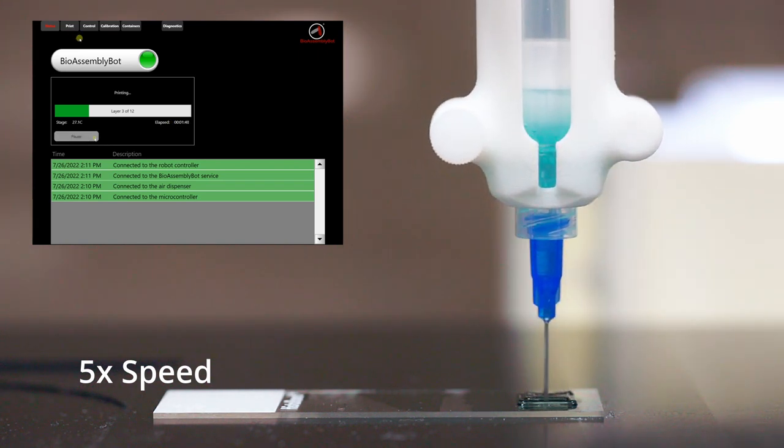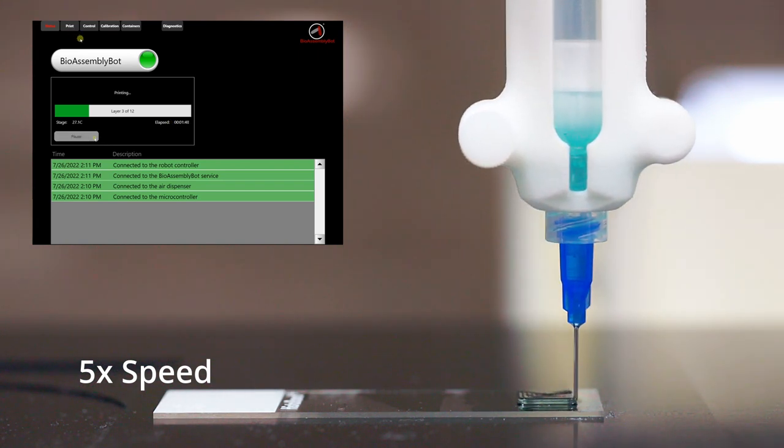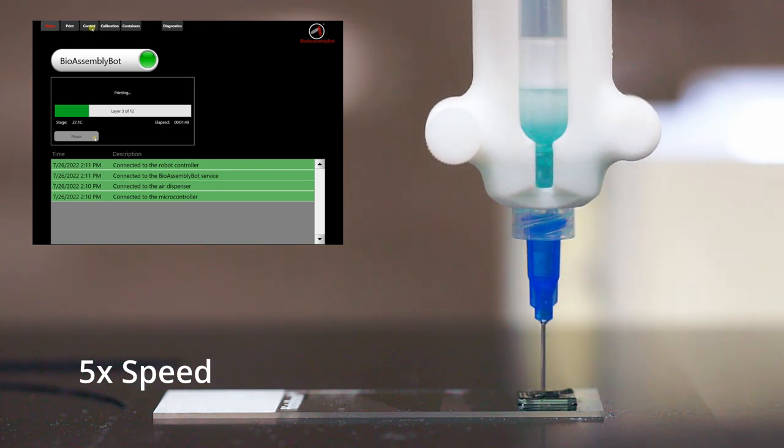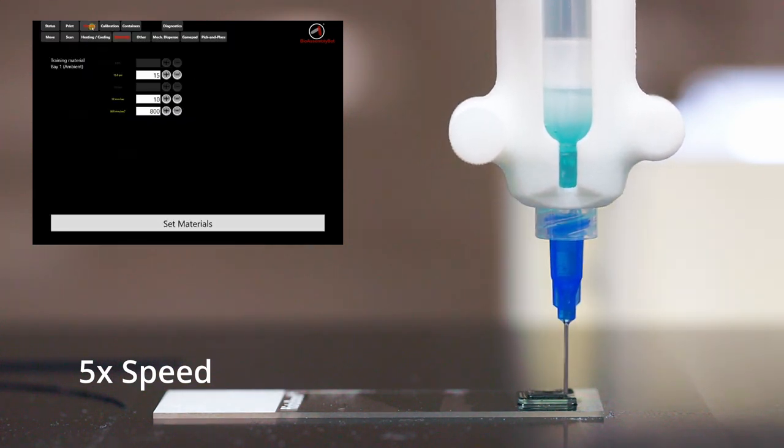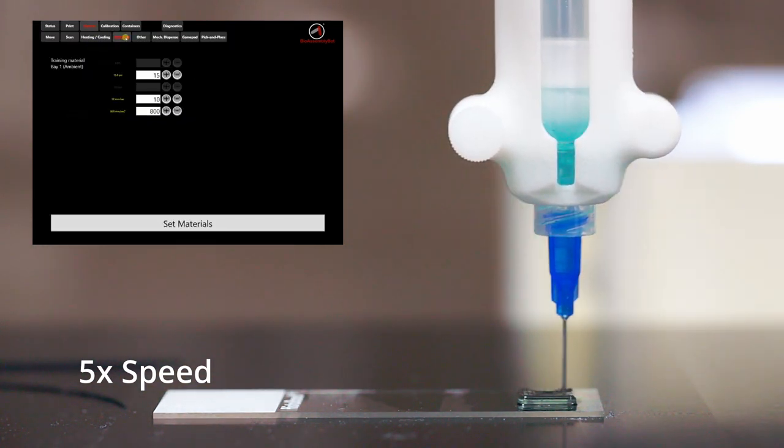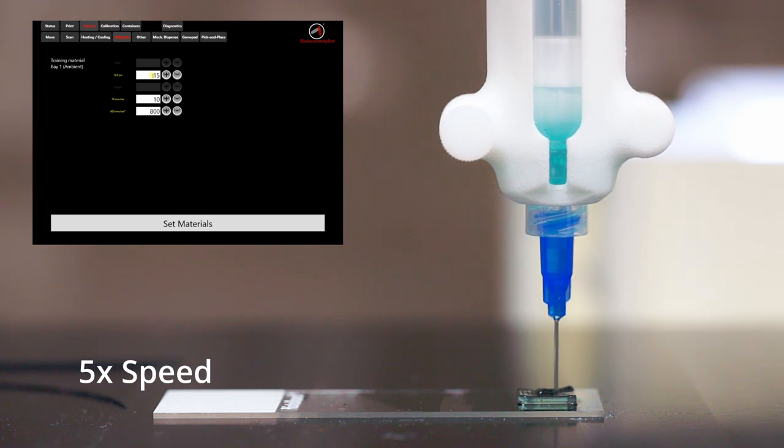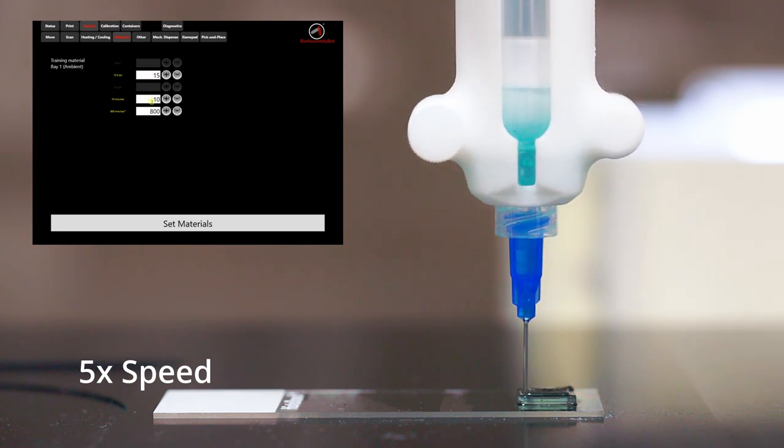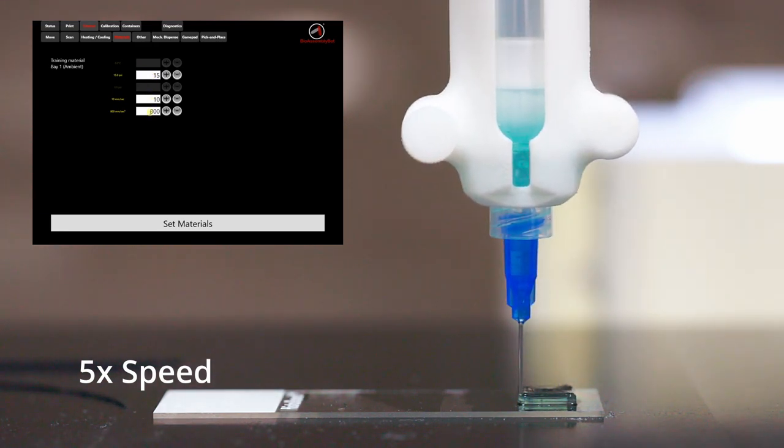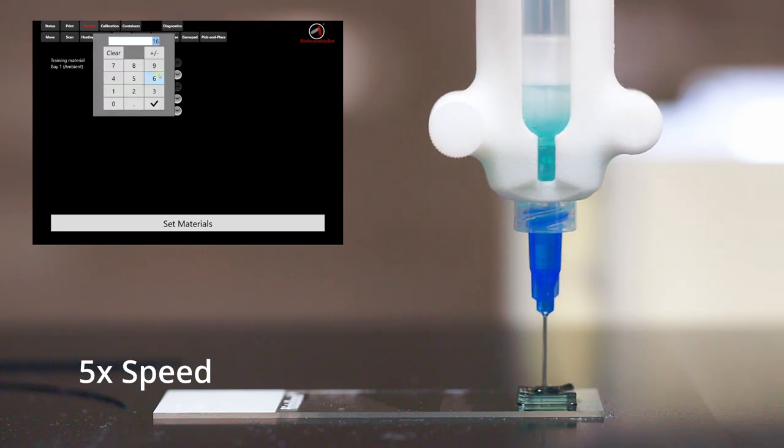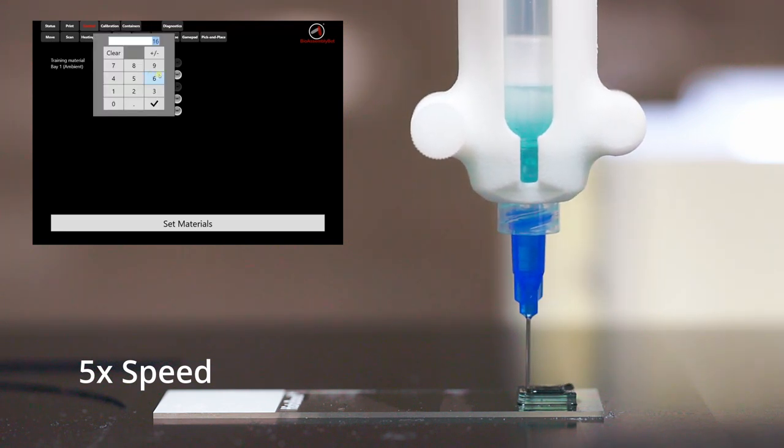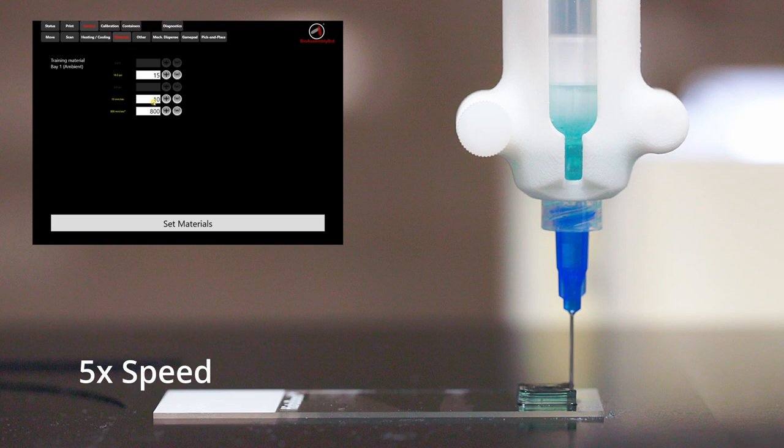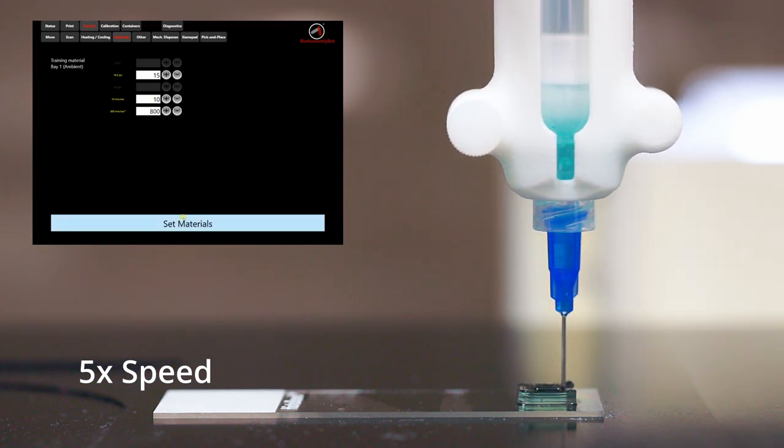If you want to change the printing parameters during the printing process, go to Control menu and click on Materials. Now, we can change the extrusion pressure, print speed, and acceleration as needed. We can change the extrusion pressure to 15 and click OK. Now, click on Set materials to apply the new pressure.